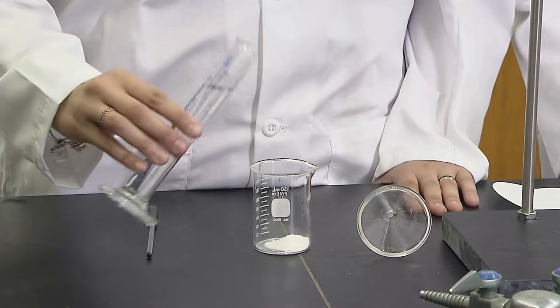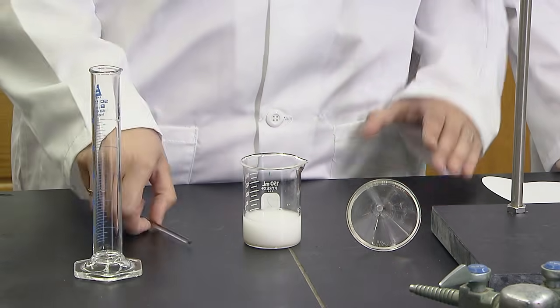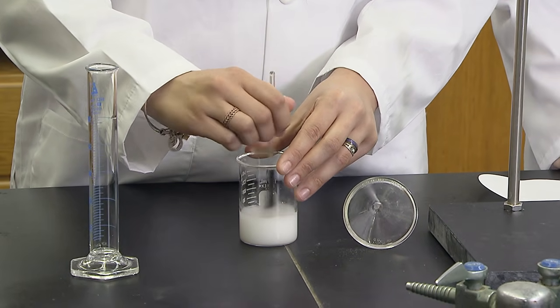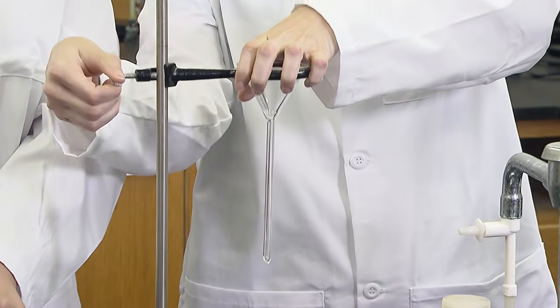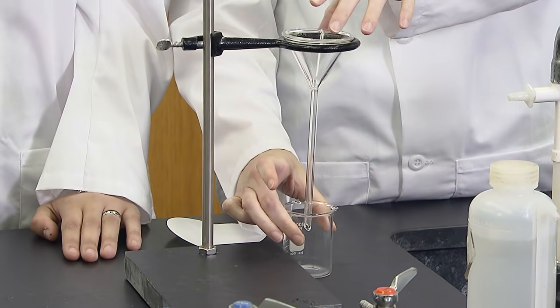Add 50 milliliters of DI water to beaker 1. If you need a reminder of how to measure with the graduated cylinder, check out the How to Read Graduated Glassware video. Now stir the mixture with the water for 10 minutes. While I'm stirring, Sophie, can you set up the gravity filtration apparatus? If you need more information on this, check out the How to Set Up Gravity Filtration video.